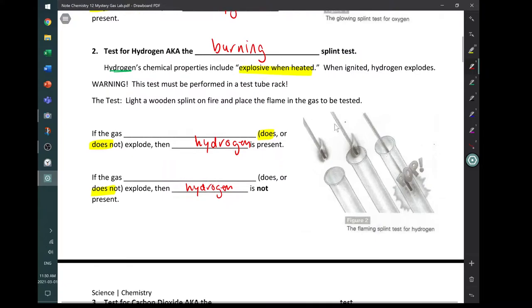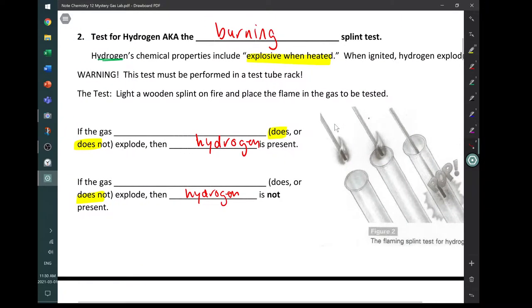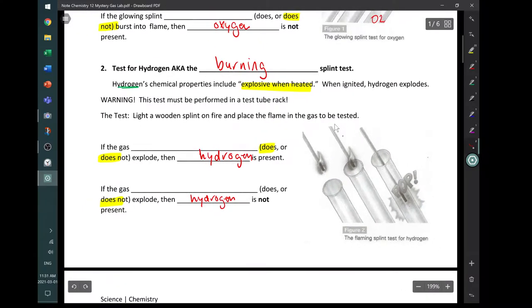The second test that we're going to do is a test for the gas called hydrogen. Now both oxygen and hydrogen are going to be clear, odorless, colorless, tasteless gases, and they wouldn't be possible to test with your senses. So we're going to use this burning splint test. Now one of hydrogen's chemical properties is the fact that it's explosive. So if we heat hydrogen up, it can explode. So when ignited, hydrogen explodes.